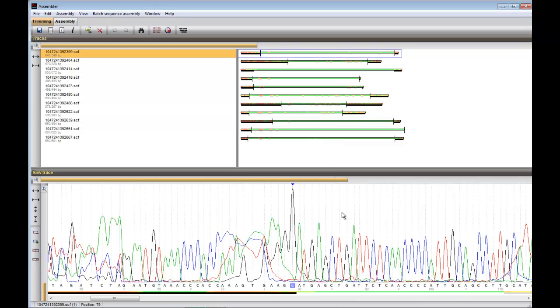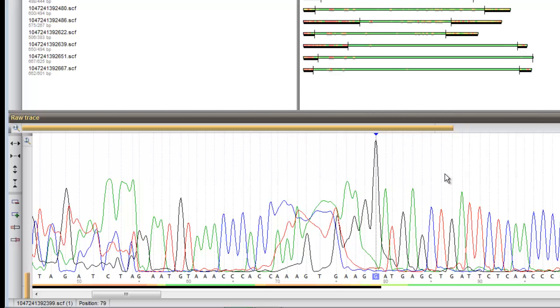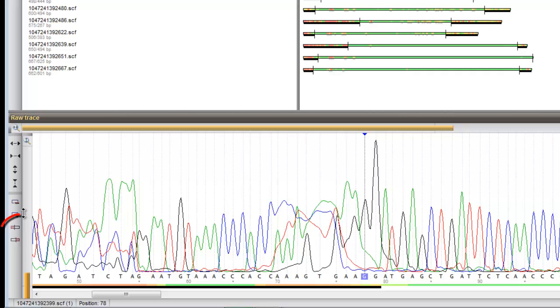Trimming ends can be adjusted manually. If I don't want these two black peaks to be trimmed off, I click on the first black peak and on Mark Start of Sequence.